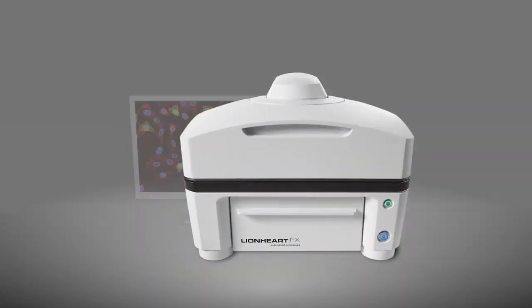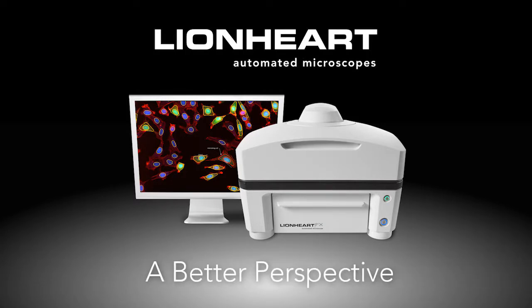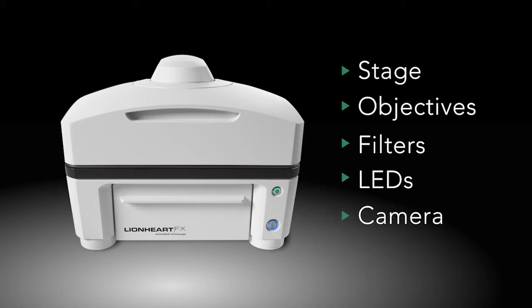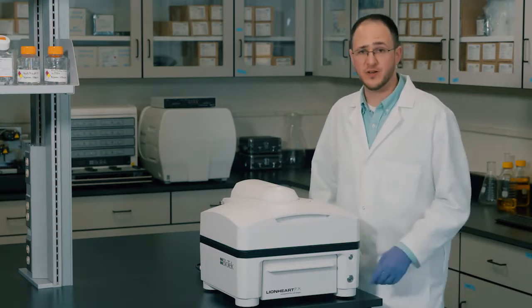Lionheart Automated Microscope, with its affordable, integrated hardware and easy-to-use, powerful software, offers a better perspective for endpoint and live cell microscopy. This compact system integrates all the major microscopy components into an automated platform for digital wide-field microscopy. This design ensures quick setup and implementation with a short learning curve.